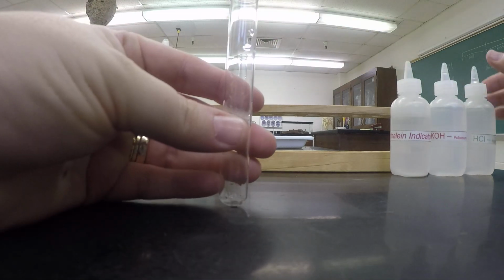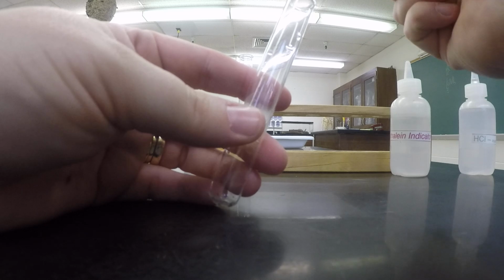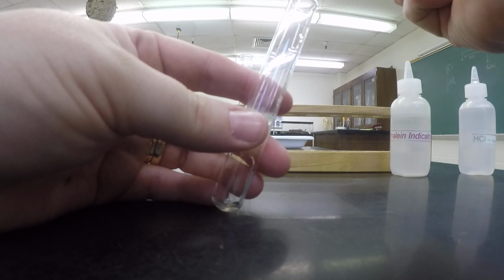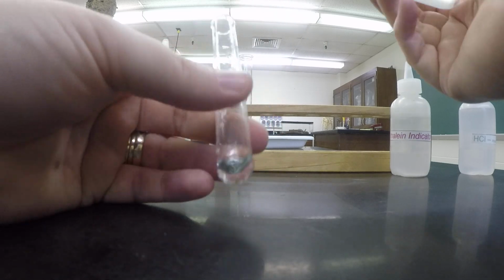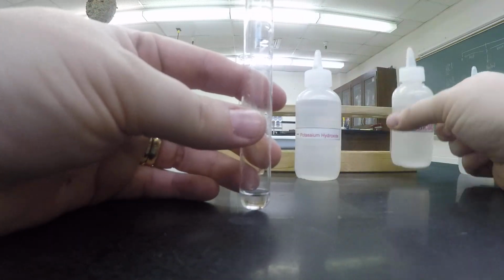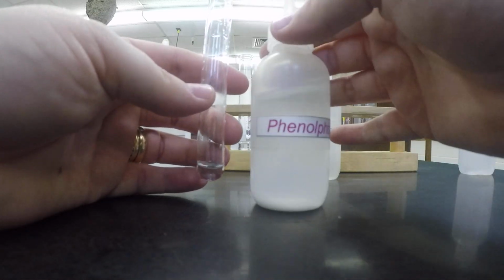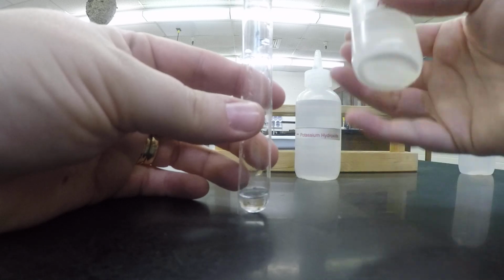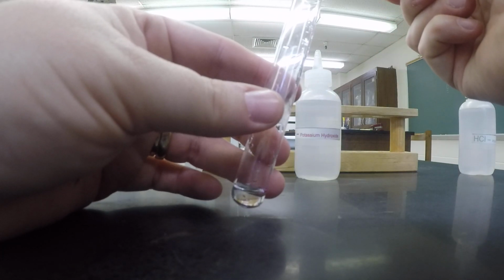Our next part, we're going to do this with a chemically made pH indicator. So I'm going to start with 10 drops of potassium hydroxide. 2, 3, 4, 5, 6, 7, 8, 9, 10. Whoops, one to grow on. Okay, and I'm going to add, this is called phenolphthalein. Okay, so this is a chemically made pH indicator. Cabbage, naturally made.